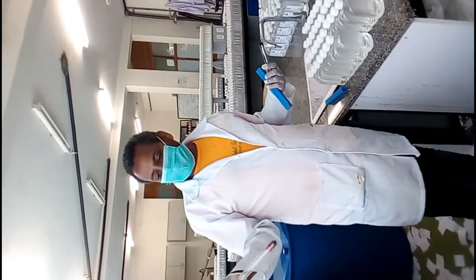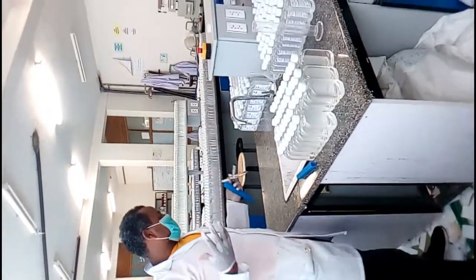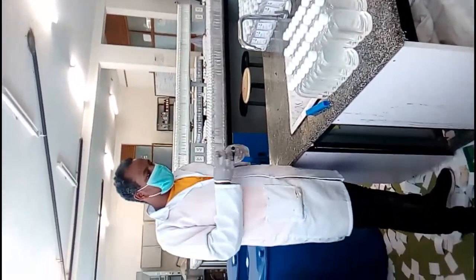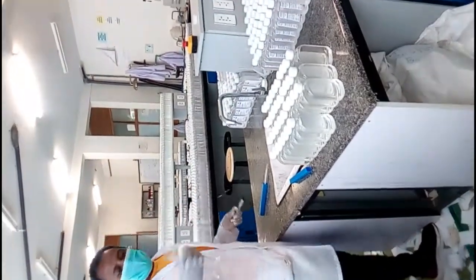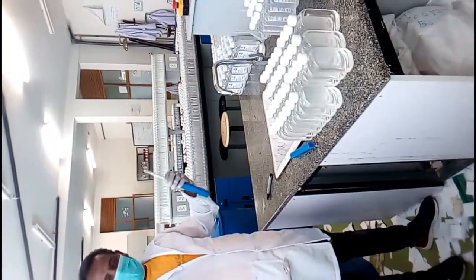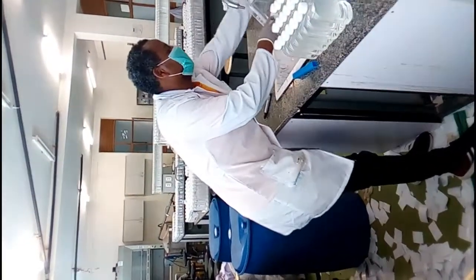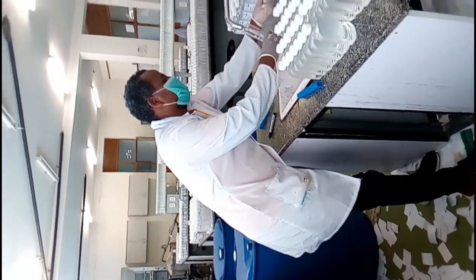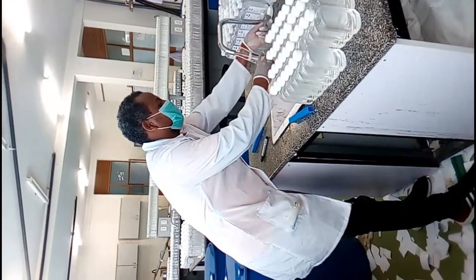Let's come to its principle. What's the principle of this? Let's start from this principle and check whether this can be done correctly or not. In order to check this, let's start from water. Can this alcohometry read normal water or not? Let's check this in principle in the lab. Let's take simple water here for testing whether it contains alcohol or not.